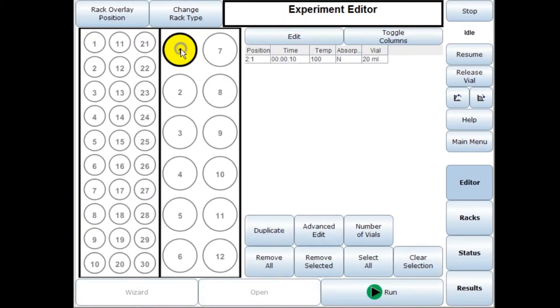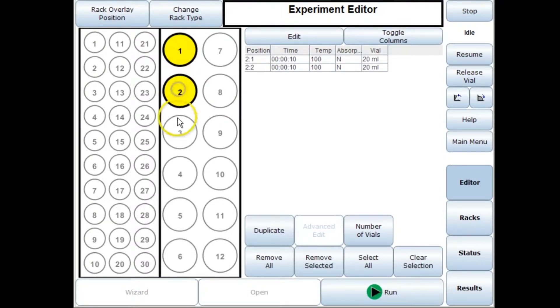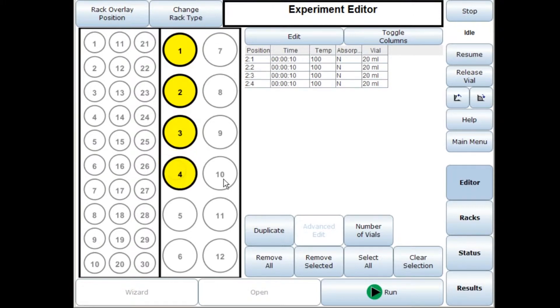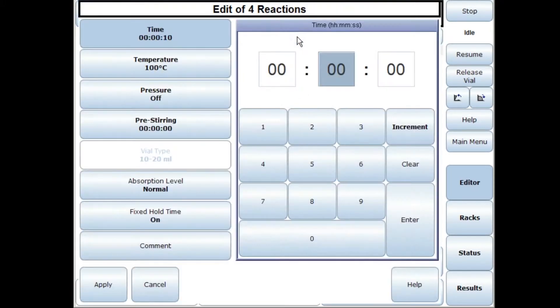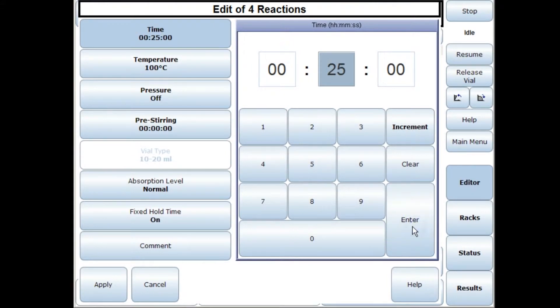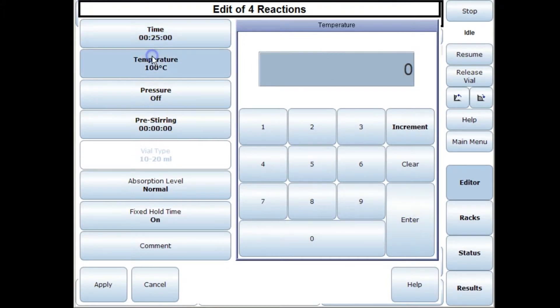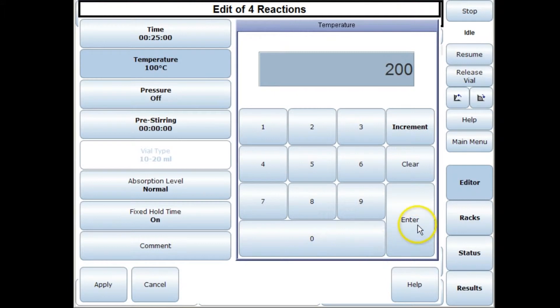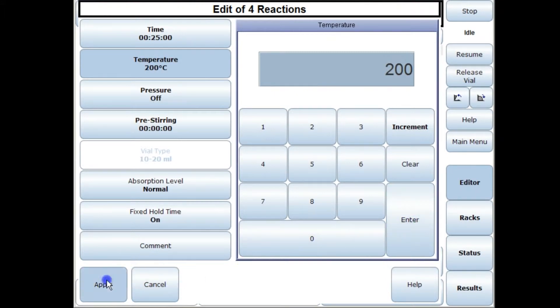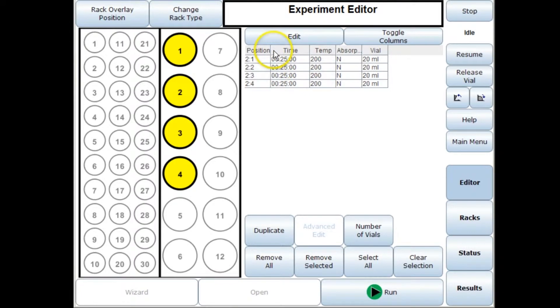You just select the four different vials, you go to edit, you put your reaction parameters in, put a temperature of 200 degrees and press apply and that's put those parameters in for each of those four different reactions.